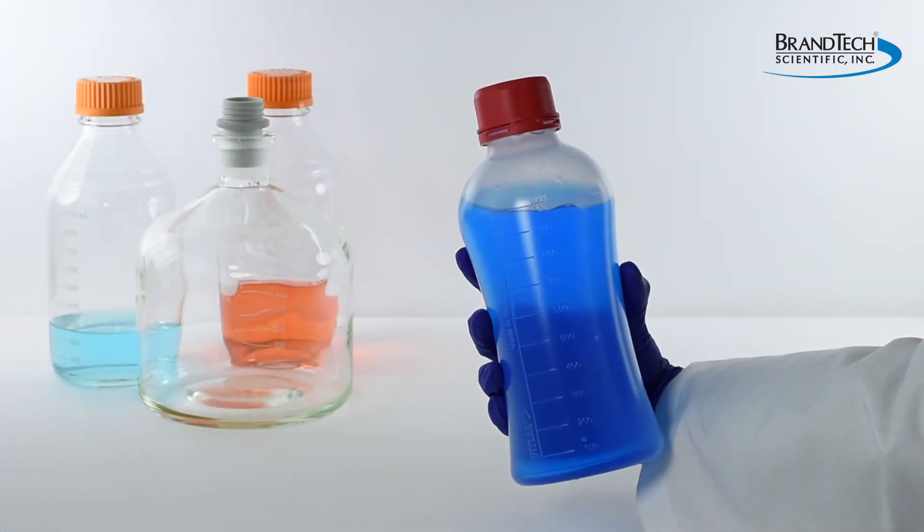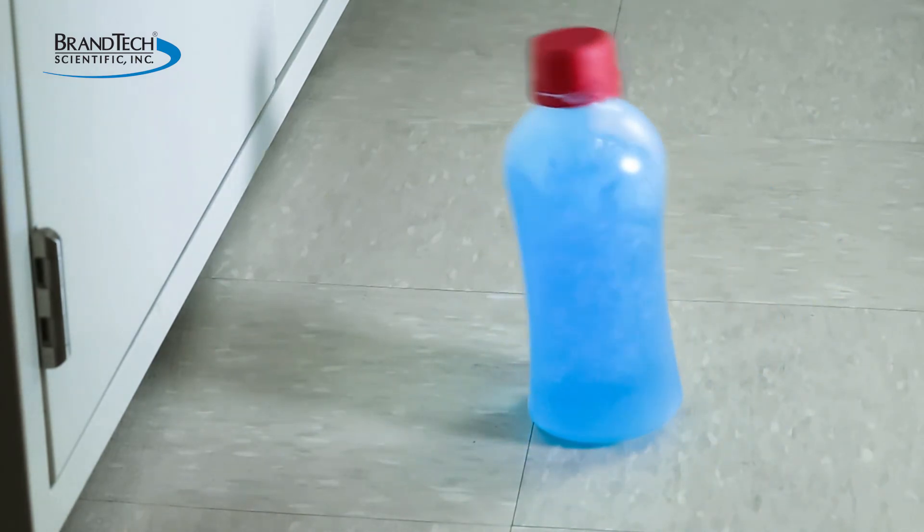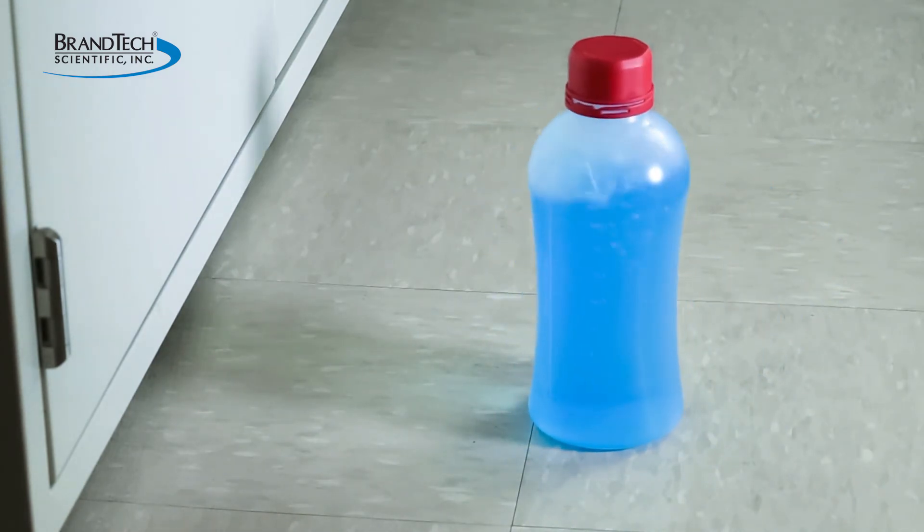VitGrip bottles are a great alternative to glass laboratory bottles. They are lightweight, ergonomic, reduce the risk of spillage and eliminate the hazards of broken glass.